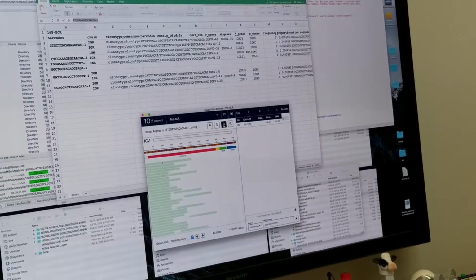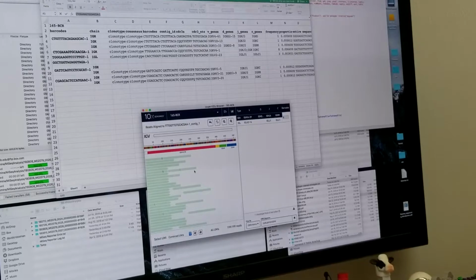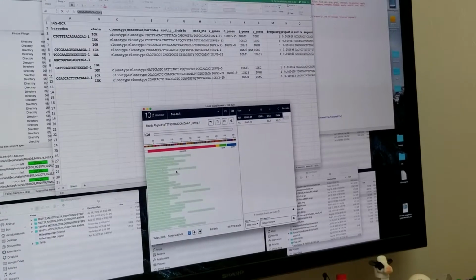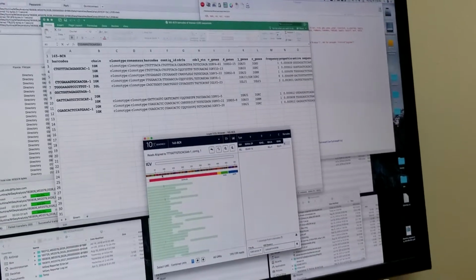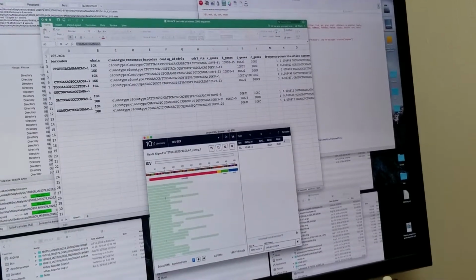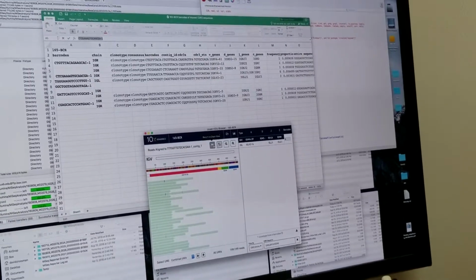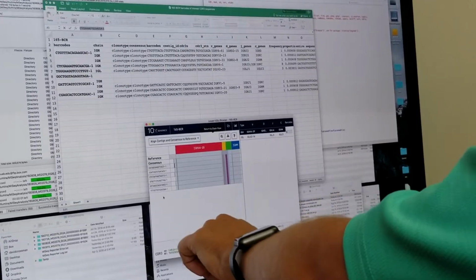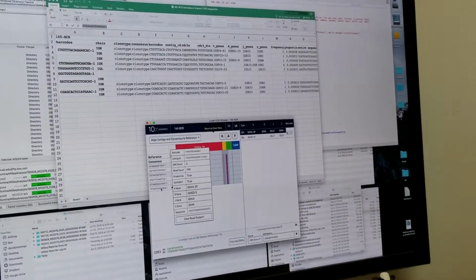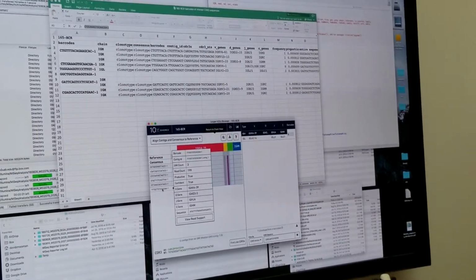I wish there was a good one in here, I just don't see one. What are you looking for? I'm looking for a deletion, and I don't see it in this data, which tells me that the way they have their IGV set up inside their package, this is not the reference. What do you mean it's not? I'm guessing that's not the actual reference in the human genome. Oh, okay. It's the actual sequence. I need to copy that sequence and look at it in their IGV.